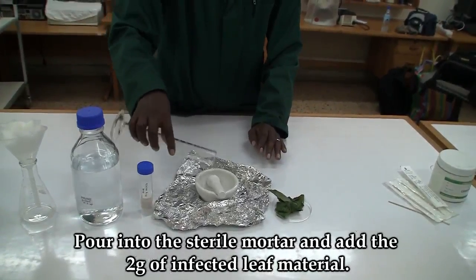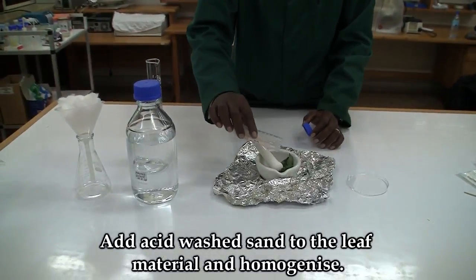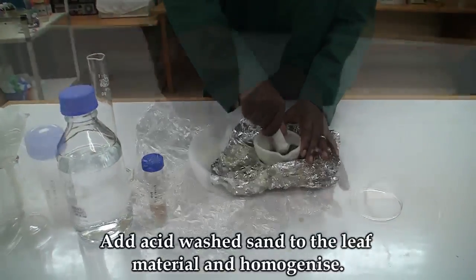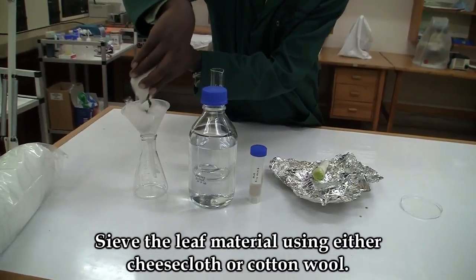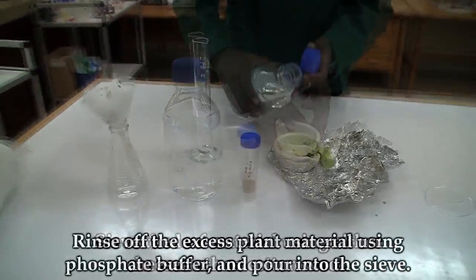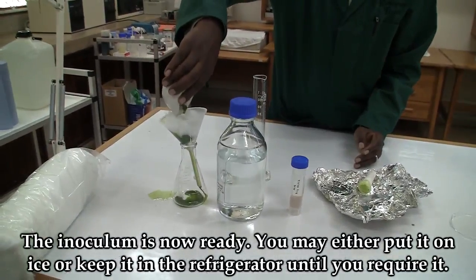Pour this into the sterile mortar and add the leaf material. Add acid washed sand to the leaf material and start crushing. Sieve the leaf material using either cheesecloth or cotton wool. Rinse off the excess plant material using phosphate buffer and pour into the sieve. The inoculum is now ready.